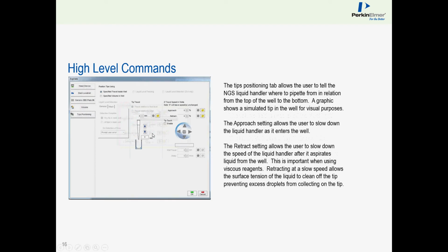And this last tab in here, in this particular menu, is telling the machine how low do I want to go in that microplate. Now, this is at 0 right now, and this where the tip is, where the graphic of the tip over the well, this is actually talking to the consumable database. Based off of the consumable that we're using, for example, if we were using a Biorad PCR plate, I'm going to make this up, let's pretend that the maximum depth was 14.5 millimeters in actual depth. And these depths can actually be obtained through the manufacturer website from the producer of that labware.